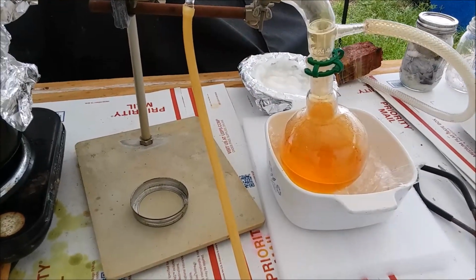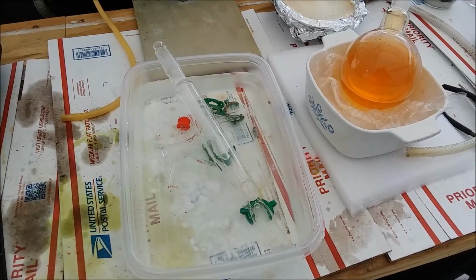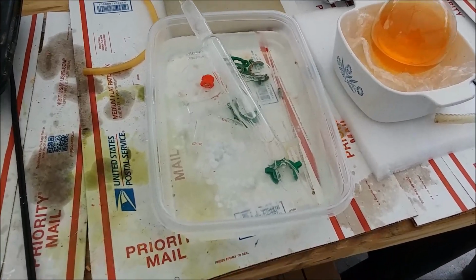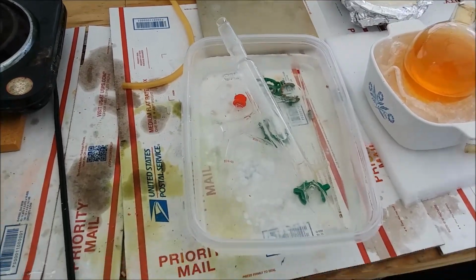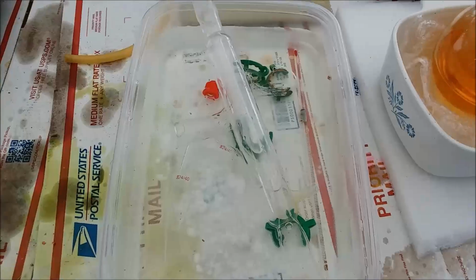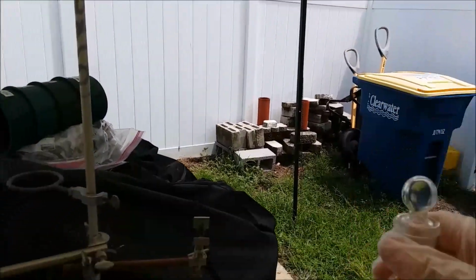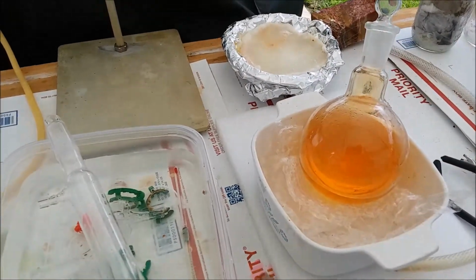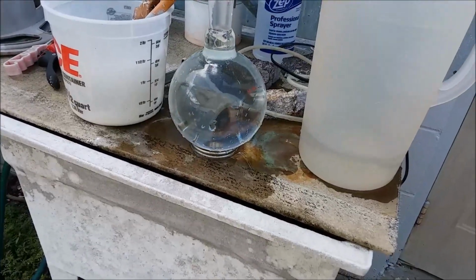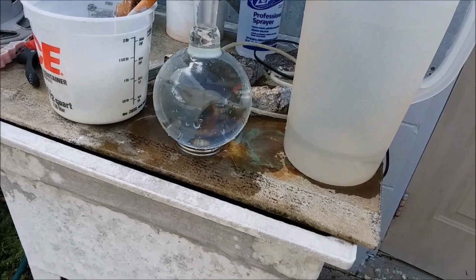I will measure it up, and we'll see what it is. Alright, second distillation's done. The glassware's soaking in baking soda and water solution. Got my product here, and boy, that does look like a lot. So I'll have to measure it out here shortly. And the 1 liter flask is over here cleaning up very quickly again, just like the 2 liter flask did.